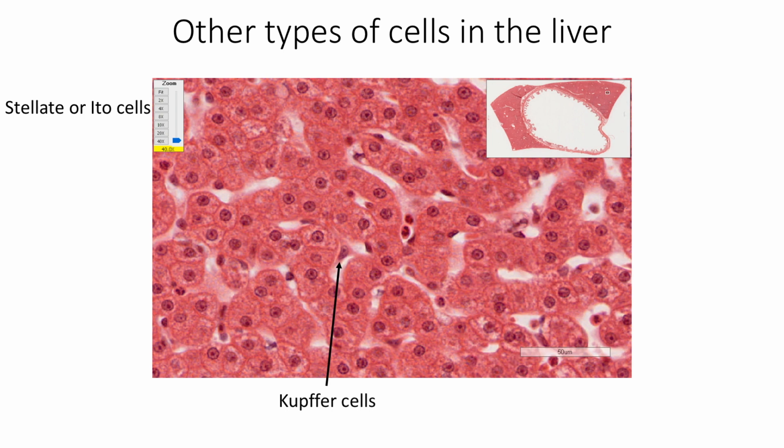Kupffer cells are the hepatic macrophages. They are irregular cells with long processes seen in the internal surface of sinusoids. They form the part of mononuclear phagocyte system and help in removing the microbial debris in the sinusoids. Following splenectomy, they also help in phagocytosing old RBCs.